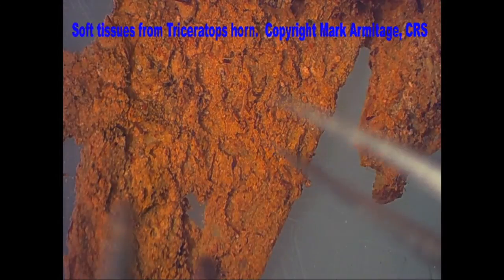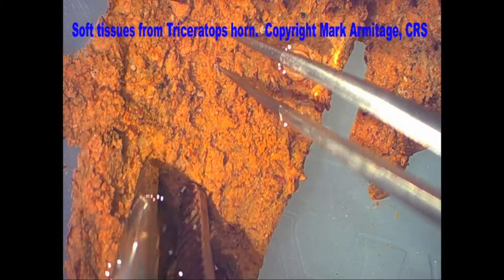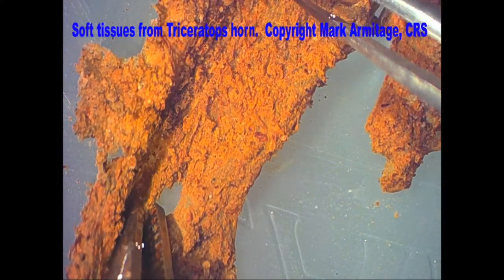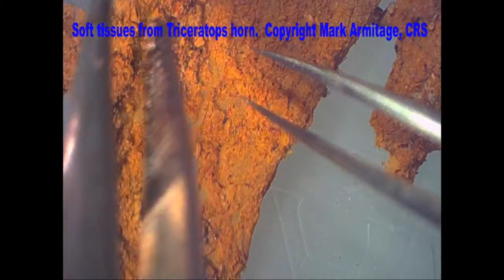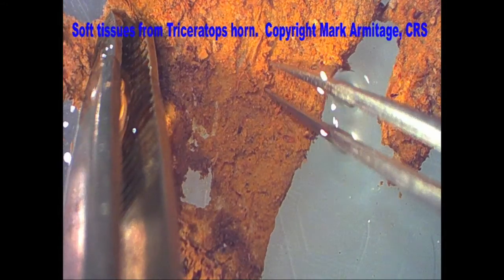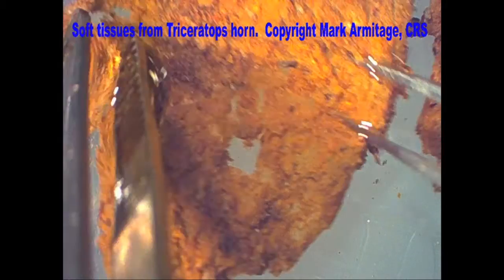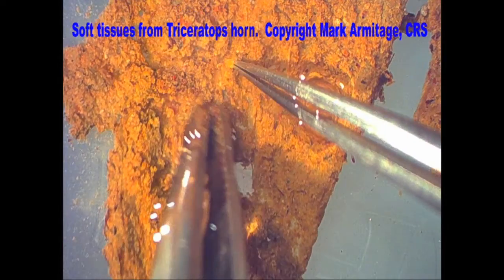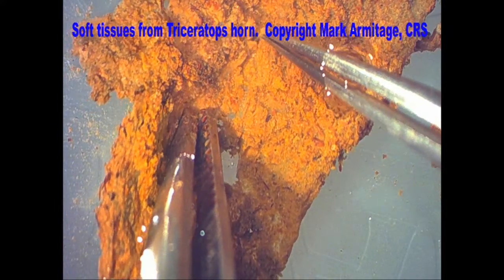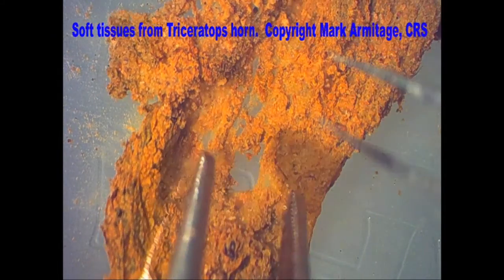Here we've redone the experiment with a lighter fixative. We have a piece of biofilm pulled from another piece of triceratops horn — look at how stretchy this is, almost like taffy. These biofilms, where bacteria come and eat the triceratops tissue, leave these films. Inside are pieces of triceratops tissue that we're going to thin section and show you the actual cells of the triceratops bone tissue — the soft remaining tissue in these bones — under high magnification microscopy.